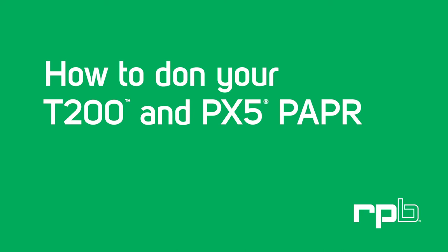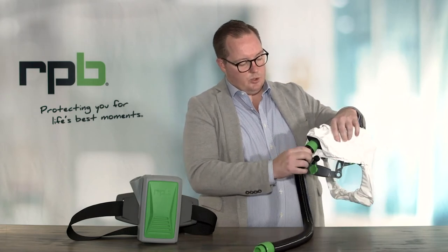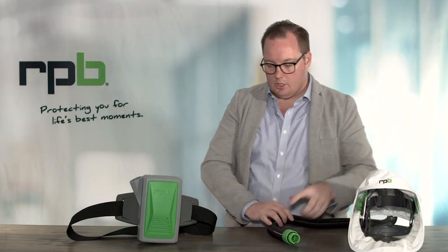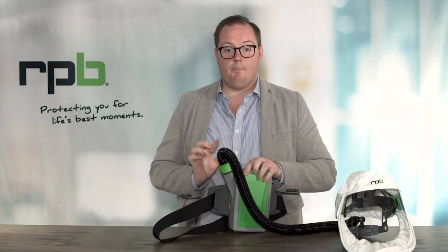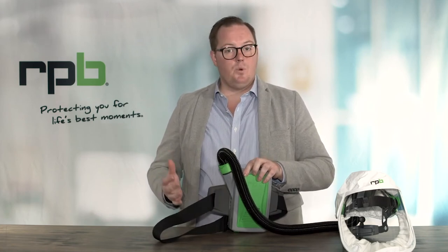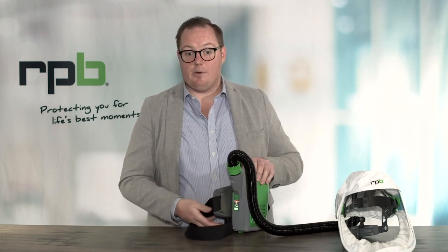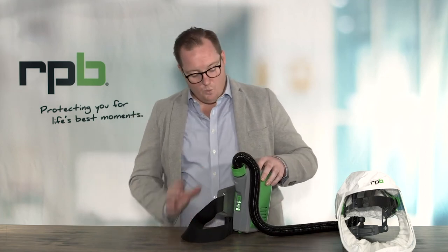In this quick video we're going to show you how to attach the T200 breathing tube to the PX5 and then don the respirator for safe use. First, attach the breathing tube to the T200, threading it up good and tight to ensure a good seal to the hood. Then attach the bayonet end to the PX5, also done up good and tight to ensure a positive seal to the PAPR. Turn the PX5 on and make sure there are no visual indicators showing a depleted battery or a clogged filter. With no indicators showing, you can safely put the PAPR on.